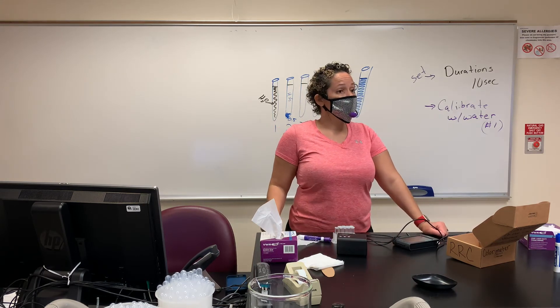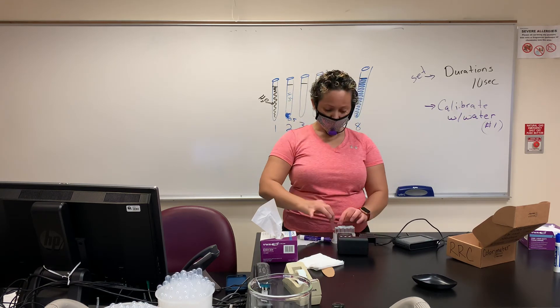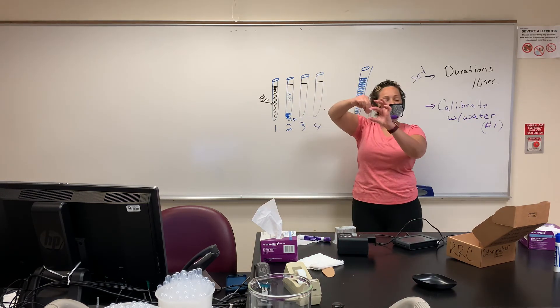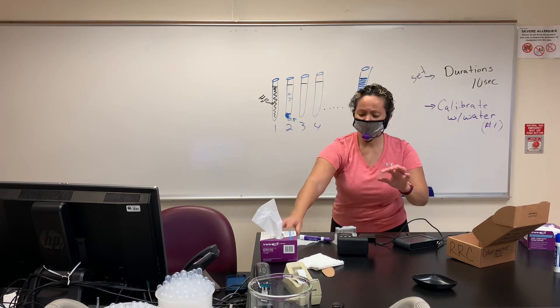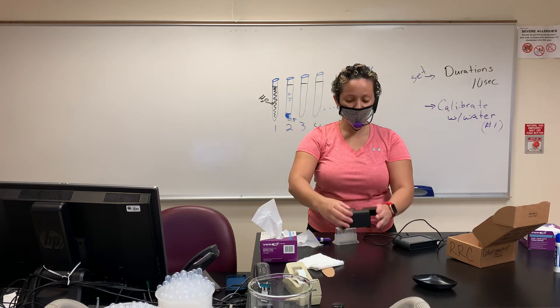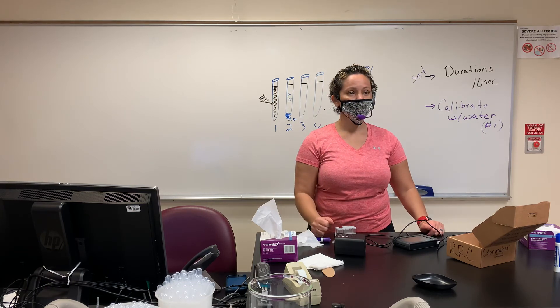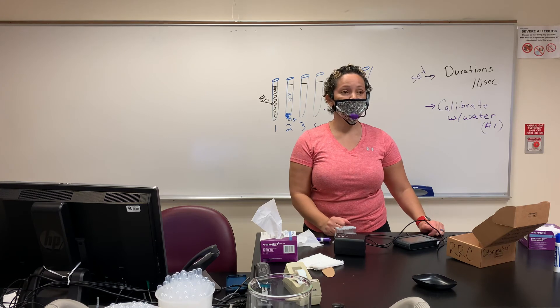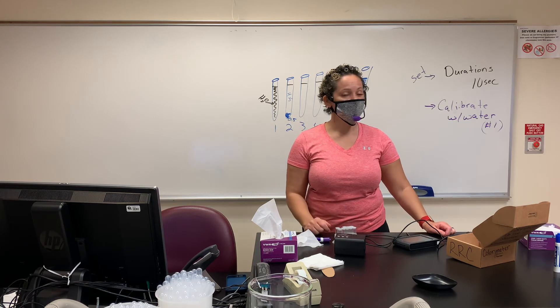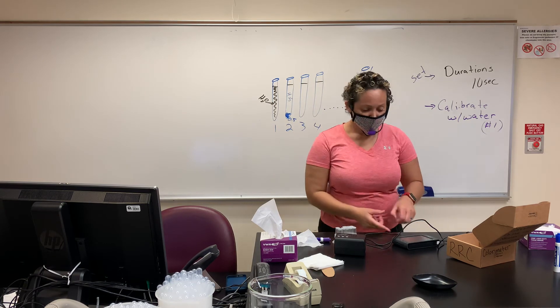Now you're ready to take measurements — watch me, because people go wrong here. Pretend this has blue juice in it — put it in there up to seven-eighths, clean it off, put it in the colorimeter, close it. Never hit calibrate again. Don't hit calibrate again — you'll end up with all zeros because you'll keep telling the computer that that's zero. Only hit calibrate when you do the first one with water only.